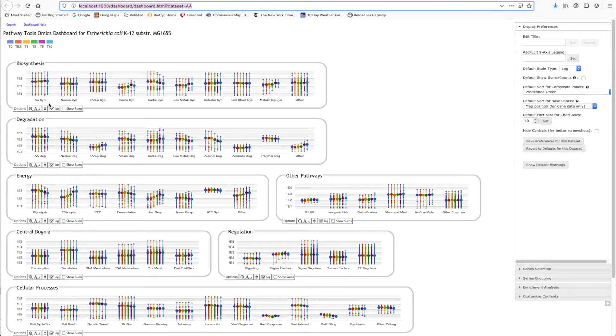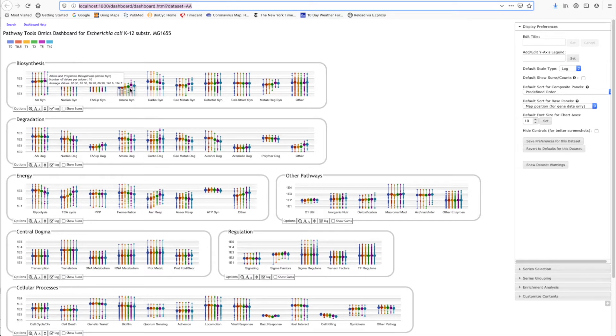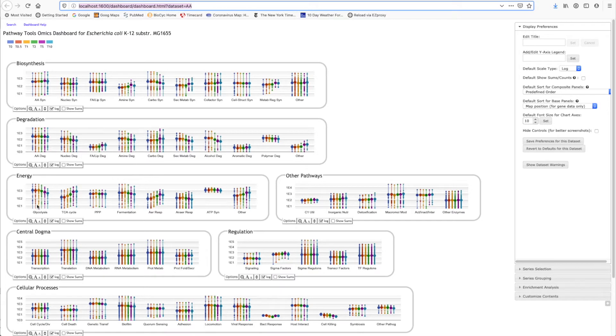And the fat dots are the averages of all the genes at one time point. So by letting your eye follow the fat dots, you can see the overall response of that area of cellular metabolism. For example, we can see that amine biosynthesis is going up, carbohydrate biosynthesis is going down during this transition, glycolysis is going down, TCA cycle is being upregulated.